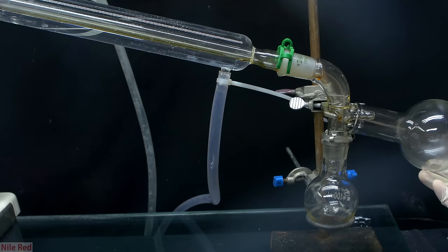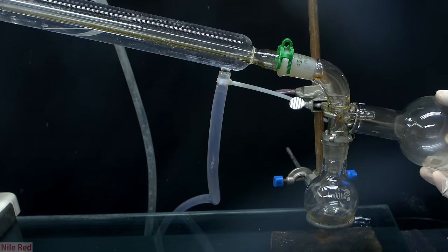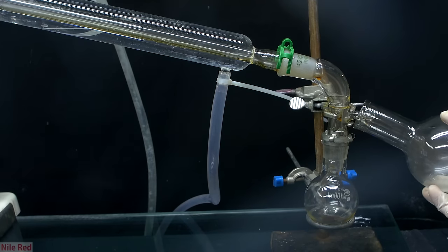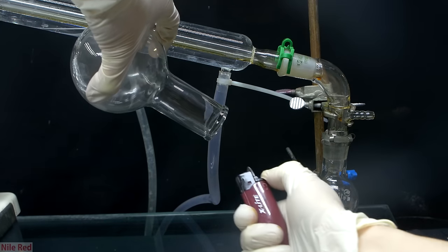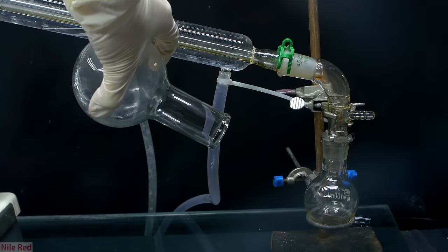One other thing to note is that this cloudy vapor slash smoke that's coming over is flammable, so you have to work in a very well ventilated area. Here I just demonstrate quickly by collecting some into a boiling flask and lighting it on fire to show that it is indeed quite flammable.